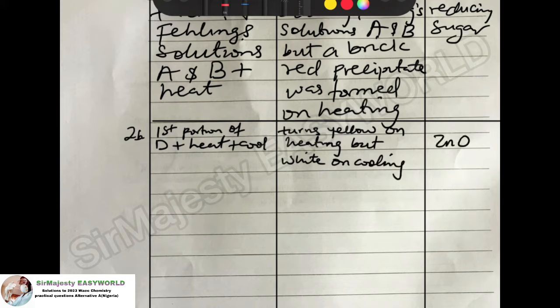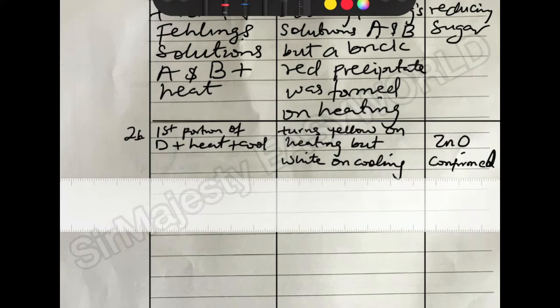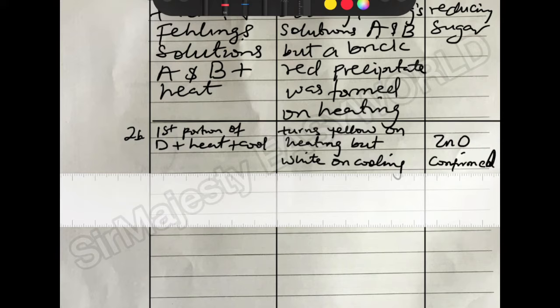Zinc oxide confirmed. It is a feature that we used to know for zinc oxide. So this is done, so we rule off again and go to the next.